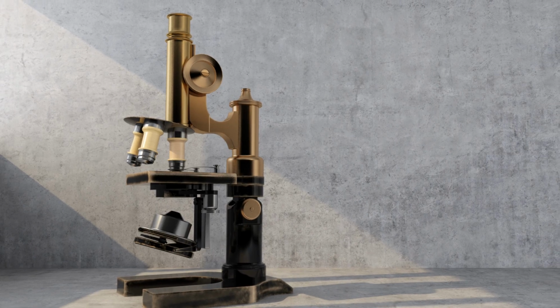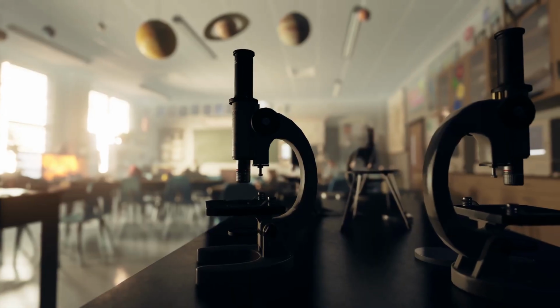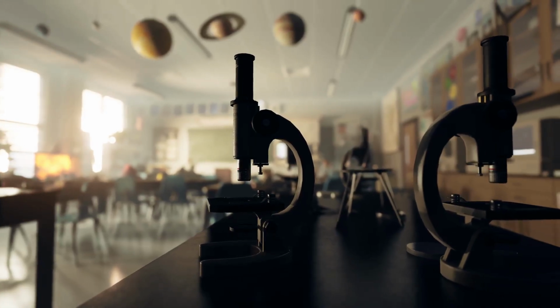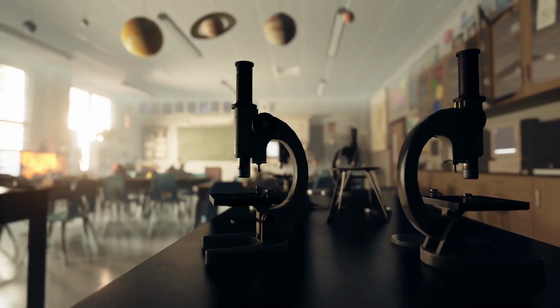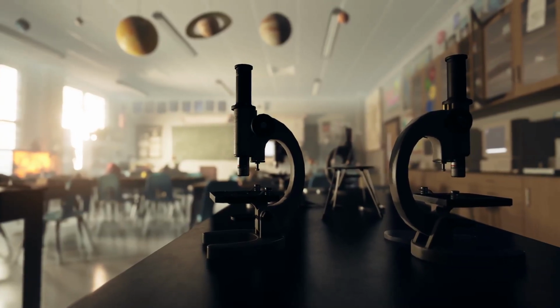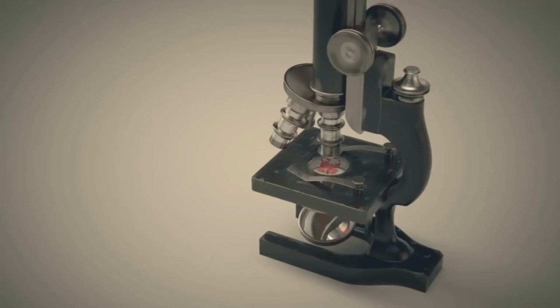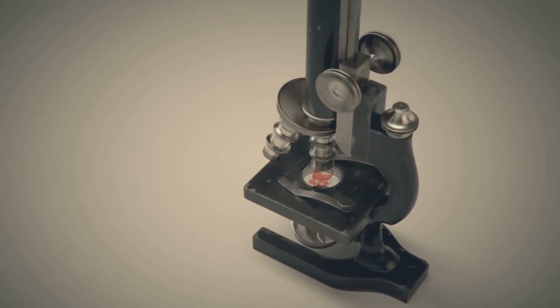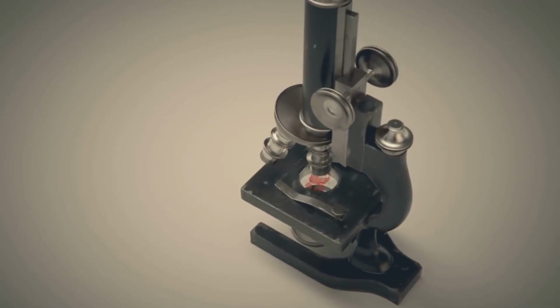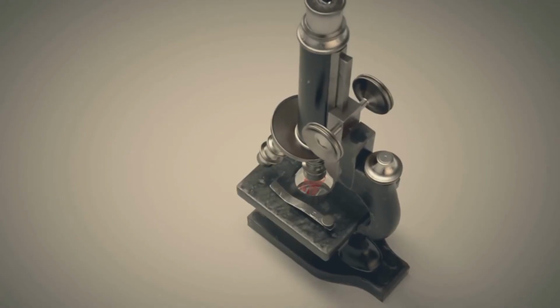Section 5. A brief history of looking closer. The story of the microscope didn't begin with a flash of genius, but with centuries of curiosity and tinkering. The journey to see the small stuff really got going in the late 1500s. Around 1590, Hans Janssen and Zacharias Janssen are credited with putting lenses together in a tube to make the first compound microscope. It was a simple device, but it planted a seed.